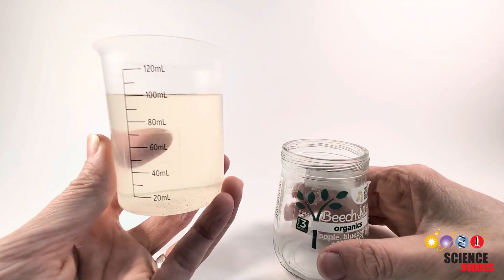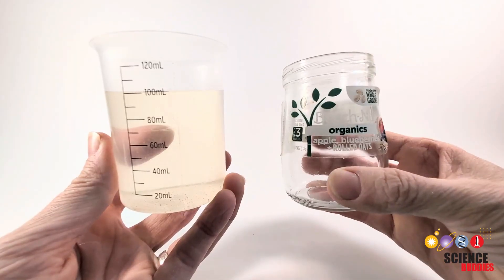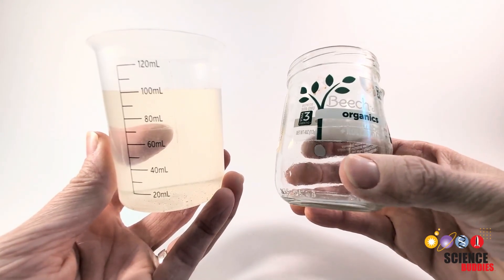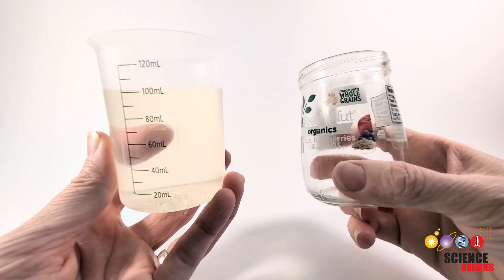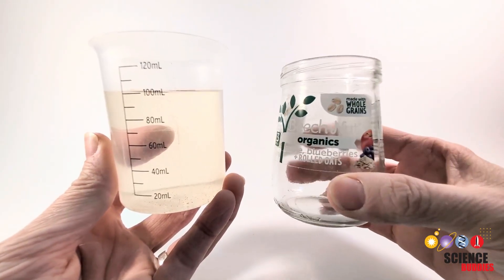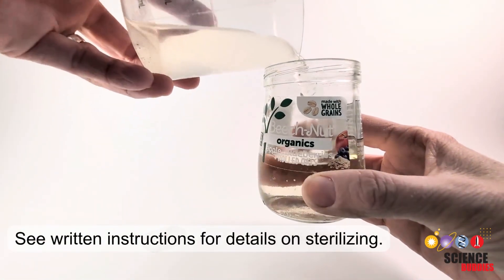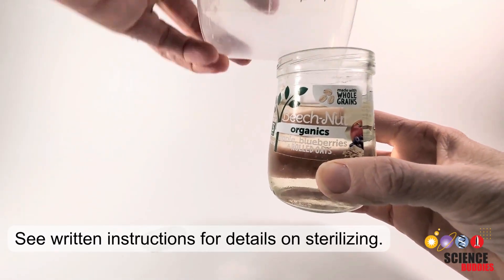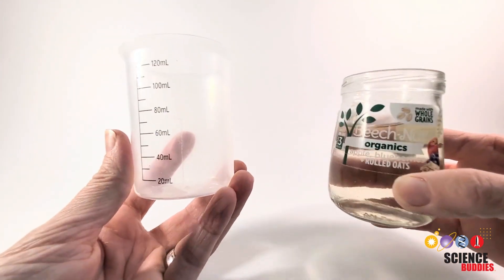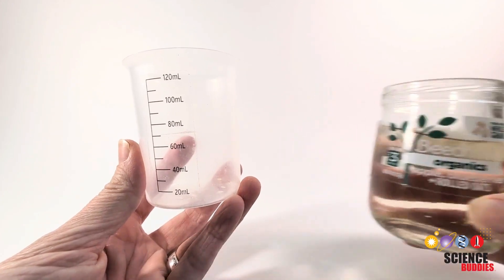So we have our 100 milliliters of pond sample, and you're going to take it and put it into the first container that we're going to use to eventually put on our agar plates. We have just a baby food container that has been cleaned and sterilized with 70% isopropyl alcohol. Similarly, you want to repeat this with the next jars that you're going to be adjusting the pH portion.